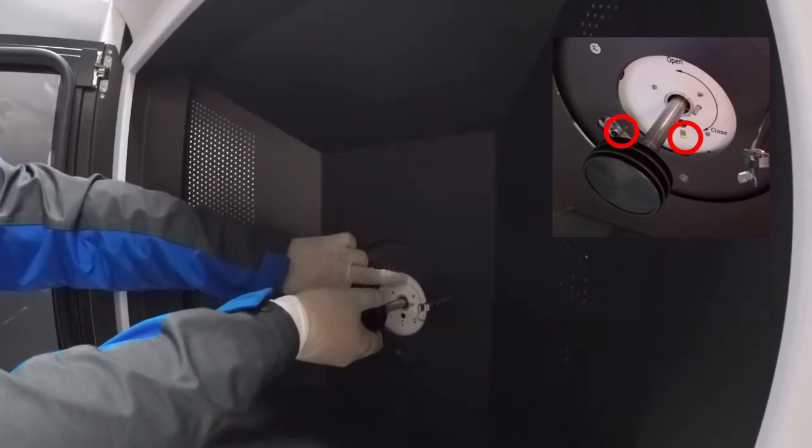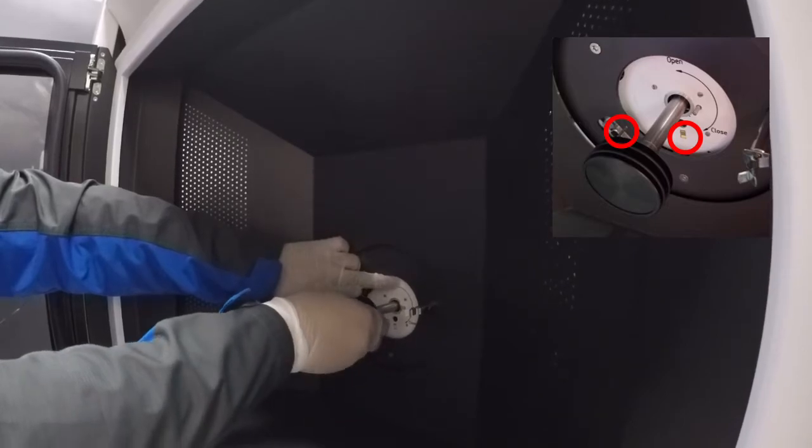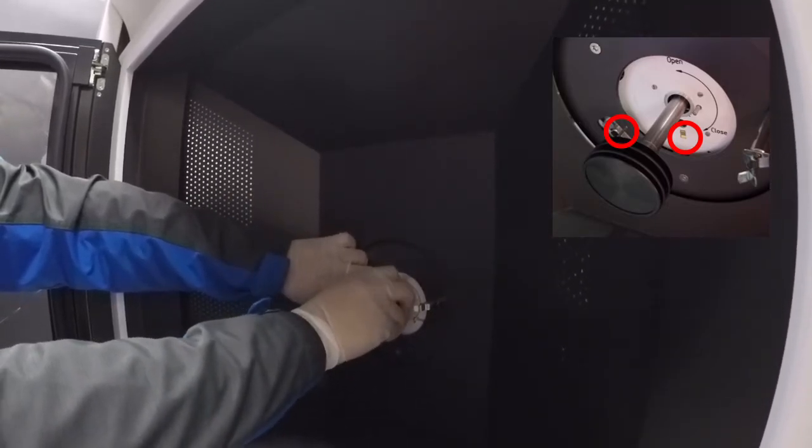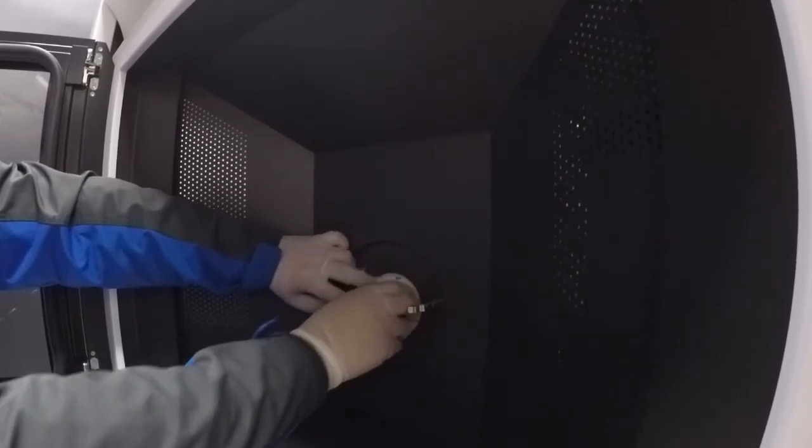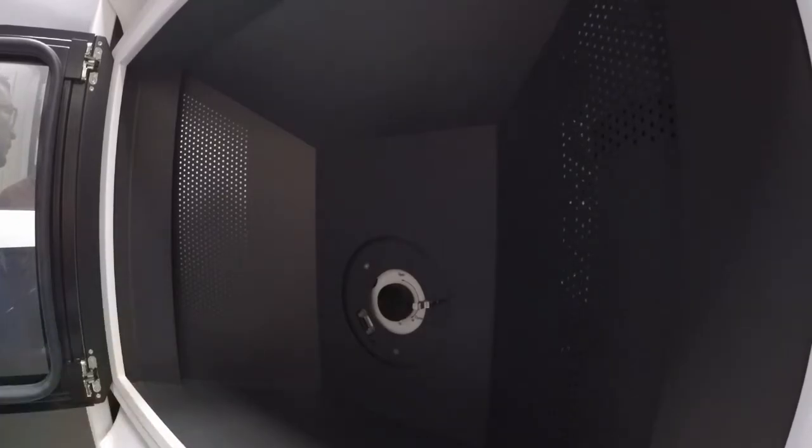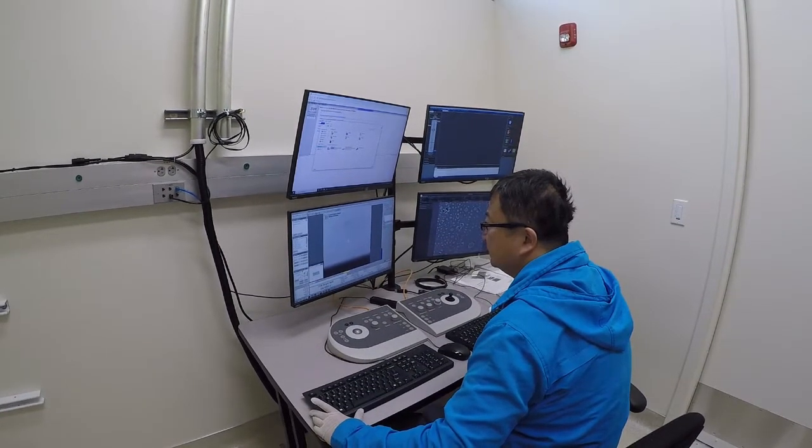Turn the holder anti-clockwise slowly to align the notch with the slot in the system, and slowly let the holder into the chamber. Give the holder a few short taps to ensure it is fully inserted. You are now ready to operate the system.